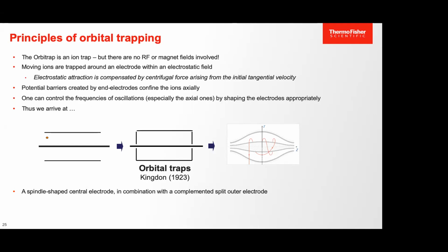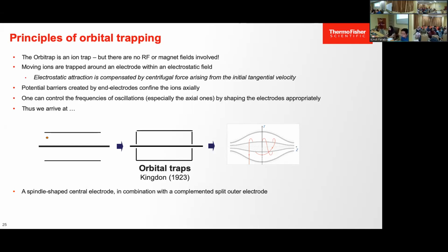So what is the Orbitrap system? It doesn't use any conventional detector. It's an electrostatic detector. Next. How it works is the ion will rotate inside the detector. Just imagine this is the detector. The ion will rotate like this. They will move left and right because both sides are high potential energy and the center is low potential. Okay, next.